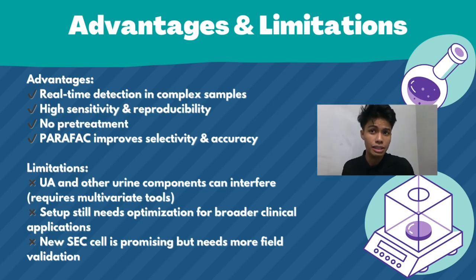Now for the advantages and limitations. This technique has many advantages. It is fast, sensitive, doesn't need sample pretreatment, and also works well with complex matrices like urine. The custom cell also adds convenience and consistency.